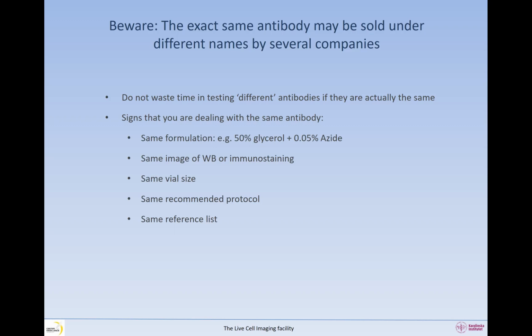It's not a new antibody, it's just packed in a different vial and given a different name. So if you think that you are buying something new, something that might work better, then you actually buy the same thing, and it's a waste of time and money.